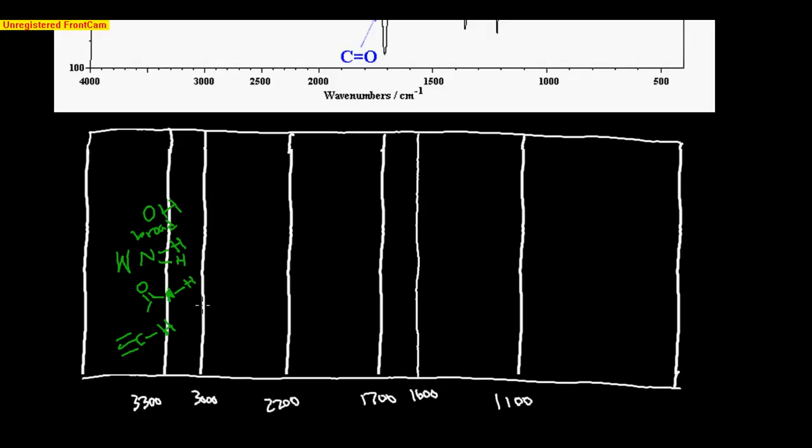Okay, let's move over to the 3000. This won't quite be to scale anymore, but I need the room, so I'm just going to slide it over.